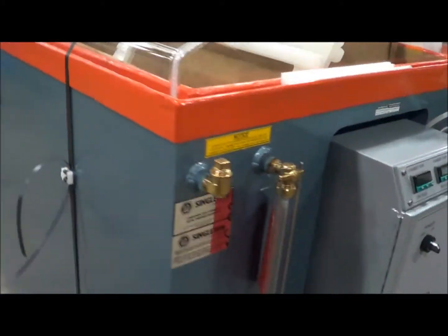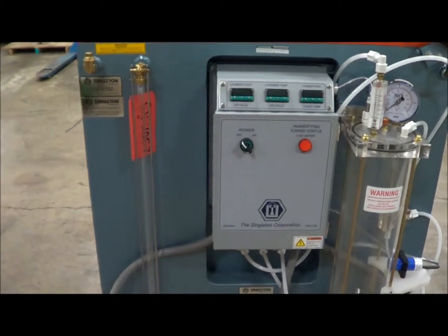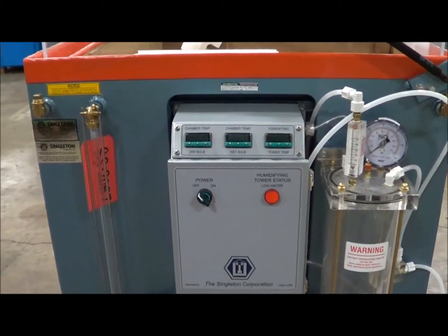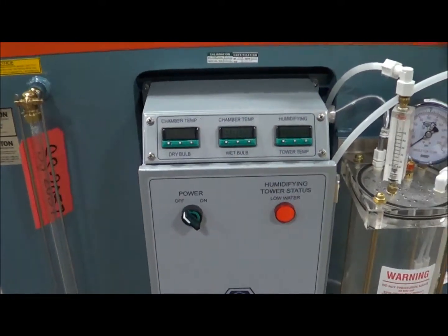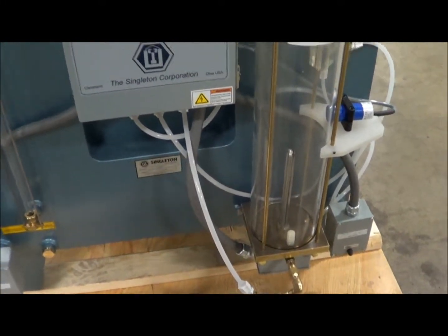This unit is 240 volt single phase. It does have digital temperature controls and a humidifying tower. It does come with the cart for the reservoirs, and is electrically heated.